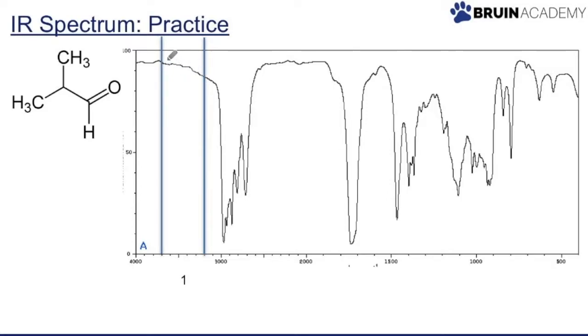There's just kind of not really any peaks, maybe a little bit of shakiness, but no peaks here. So anything in zone 1 that's indicated in our charts would indicate that there's nothing there. I'm just right now looking at a chart that has the functional group name, the bonds, the stretching frequency, and the intensity, whether it's strong or weak. I'm sure your professor will provide you something like that to look at as well for the exam, or you can look at something online.